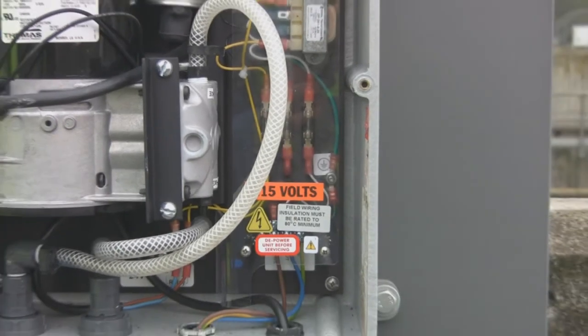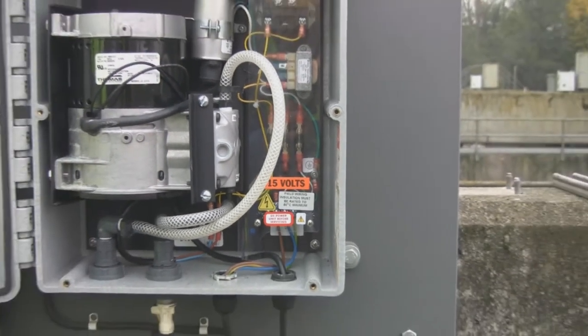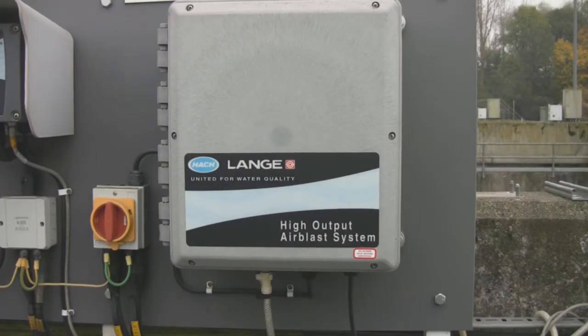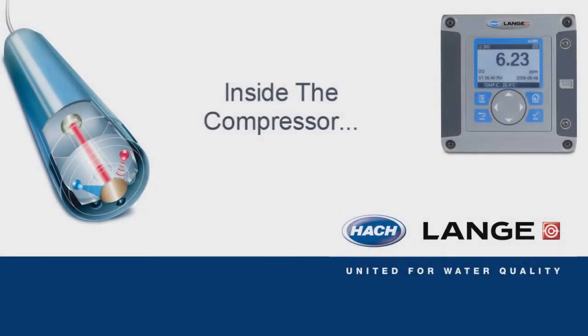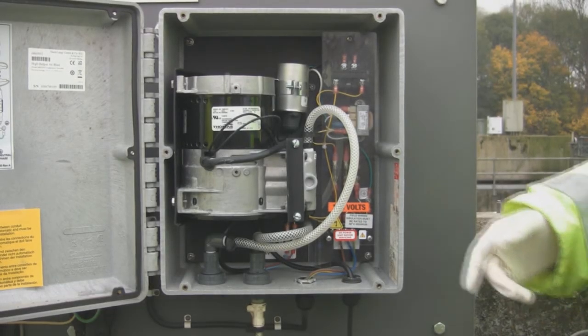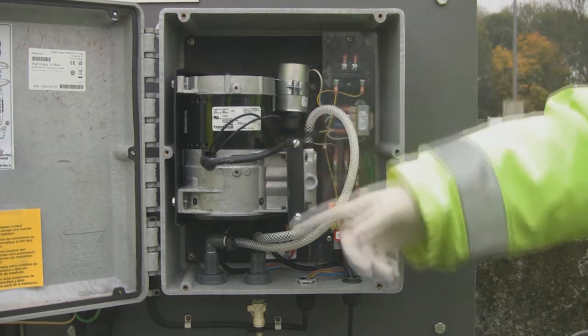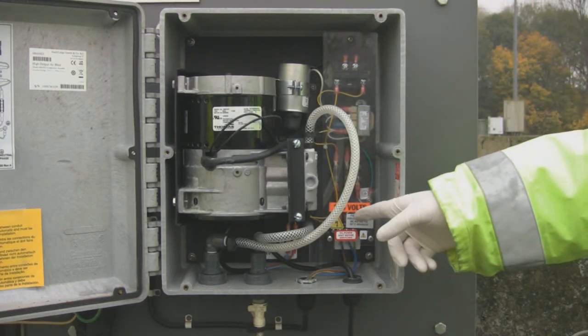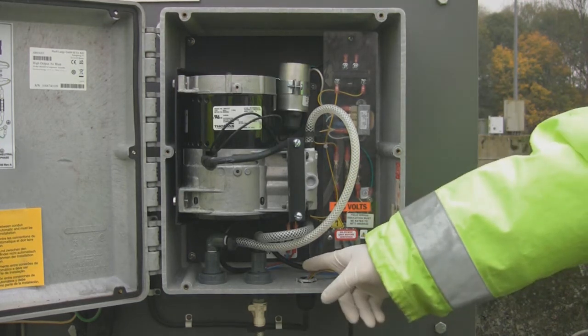Do not extend the delivery hose beyond its standard 7.6 metre length to prevent exceeding the delivery capacity of the system or degrading the response time for the air delivery. On the inside of the compressor, you will find the compressor, the air delivery system, the power terminal block and the relay block.